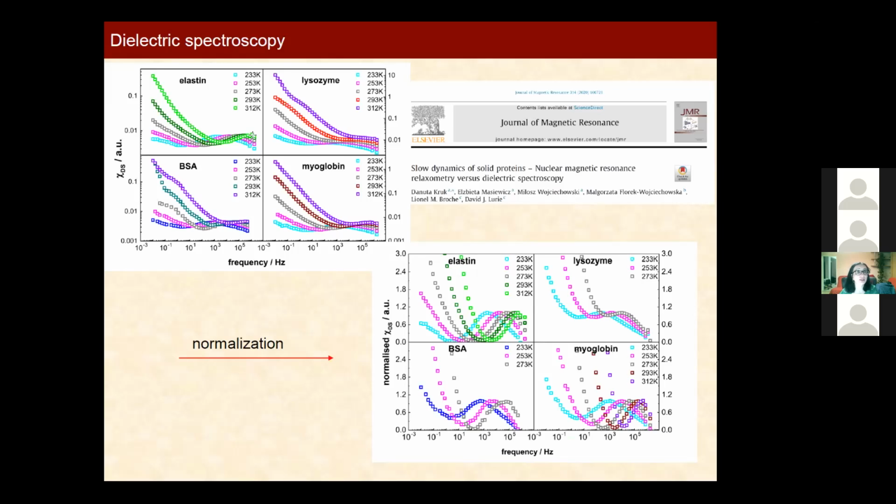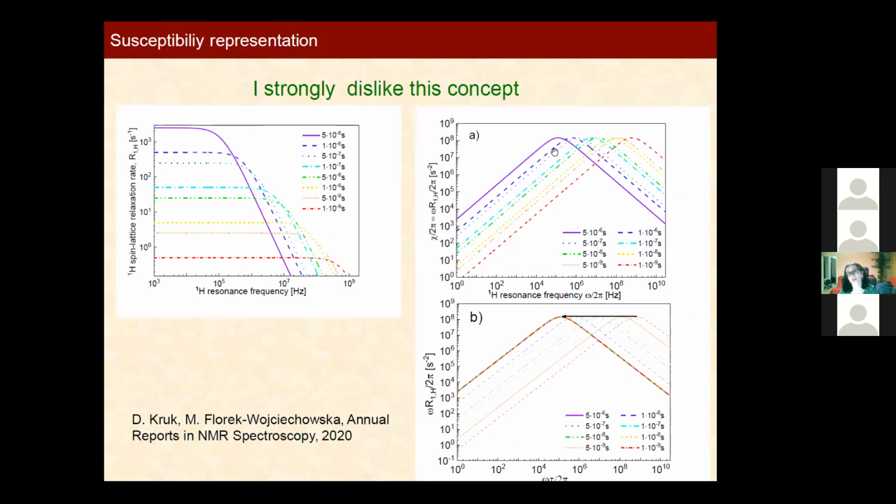If you want, I can explain it in more detail, but there's no time. What we have done here is rescale the spectrum in such a way that the data maximum is 1. I just purely rescale. However, in this way you can better see those maxima.